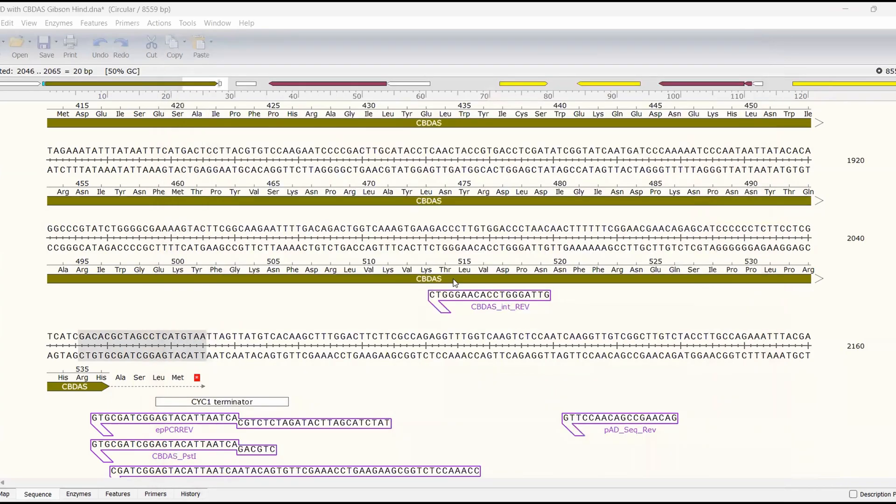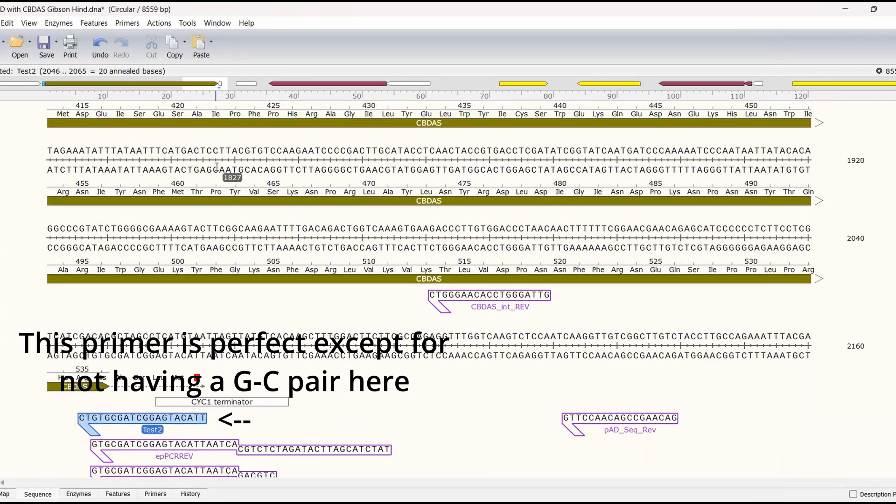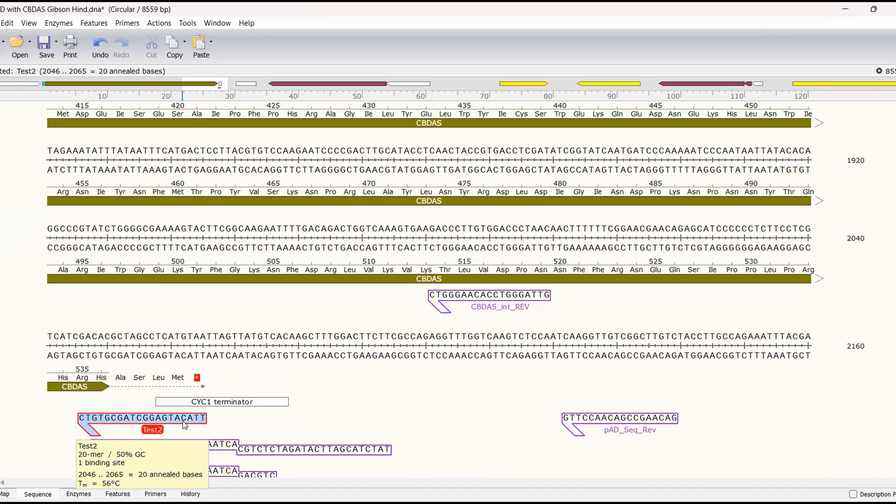So bottom strand, we'll name this test two and that's basically it. In a lot of these DNA viewing tools you can simulate the PCR amplification of products and again really what you need to do is take these, copy these primers and put them into the website of your choice that is a melting temperature calculator. I would recommend googling TM calculator Q5 polymerase for example, I use Q5 polymerase from NEB, or maybe use Taq polymerase and you say TM calculator Taq polymerase and the first result is probably going to get you there.